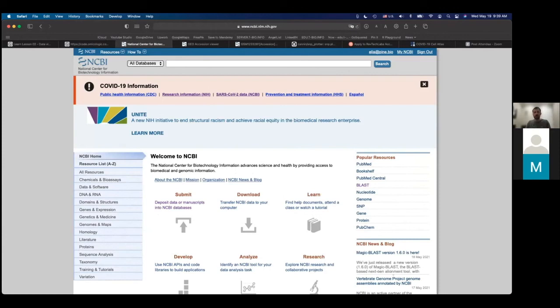Okay, so Harsh, why are we converting the data frame into a matrix? There are different methods. Some methods only work with numeric data, which is a matrix, and some methods know how to handle headers in a combined data frame. So based on the different methods that we use, we either have to prepare a matrix first, or we can use a full data frame, but sometimes we need to transform it into a different format. We'll talk about these formats in our sessions.